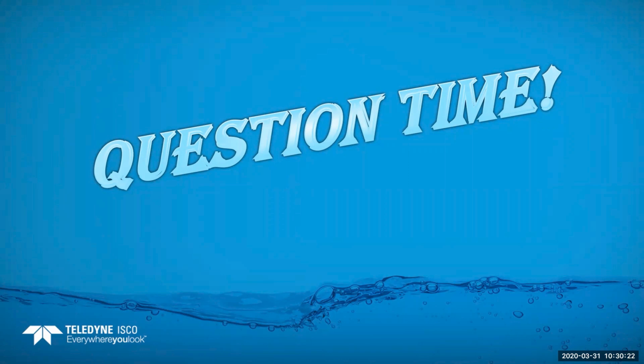What are the most overlooked preventative maintenance steps? That one is changing your pump tube. In the peristaltics, you definitely want to change that pump tube before it breaks. Most people just go until they don't get any samples anymore and they start pumping water all over the place. Yeah, that is number one. The only maintenance you want to do is change that pump tube. You can get away with just that.